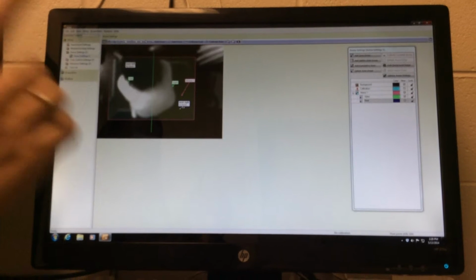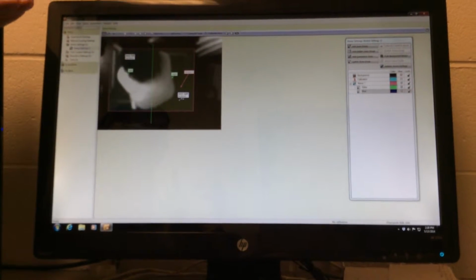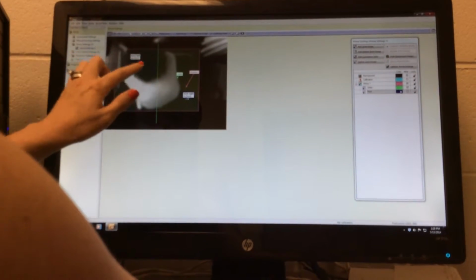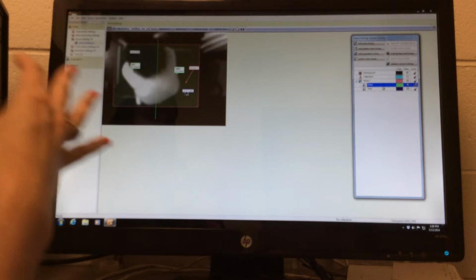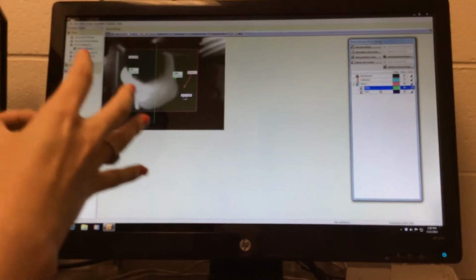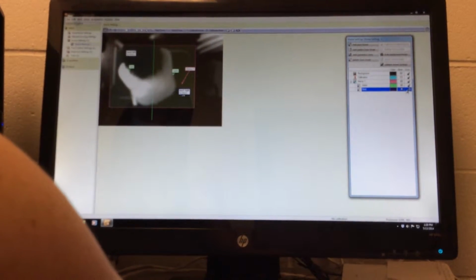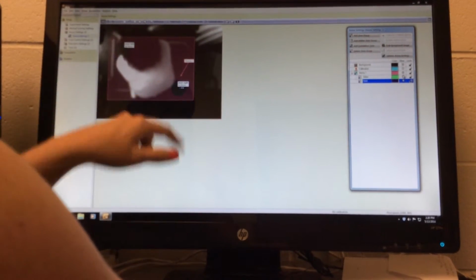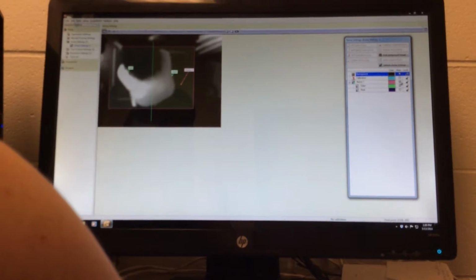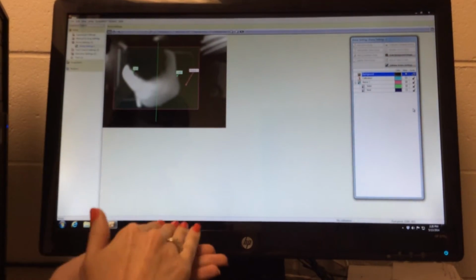The reason why I did a separate zone is because they're on top of each other. Because the nest zone is on the same side as left, if I did it in this same zone group, the software would start to get confused about what it's supposed to be tracking and where. By separating it out, it knows that this is one zone and that's a different zone. So we can see just those there, see none of them. You're kind of telling it the layers which you want it to look at.